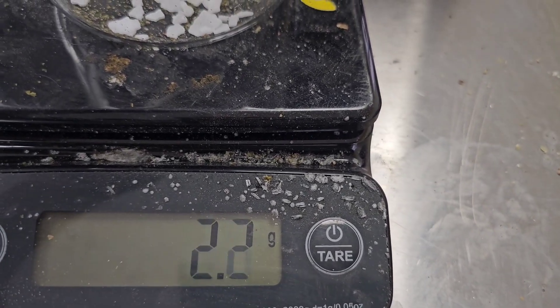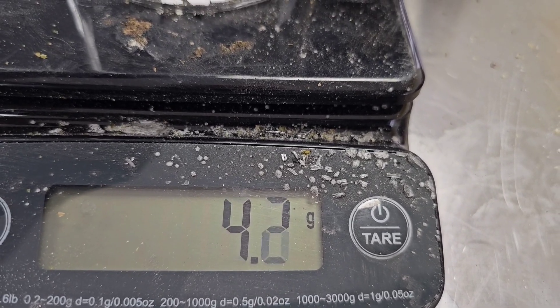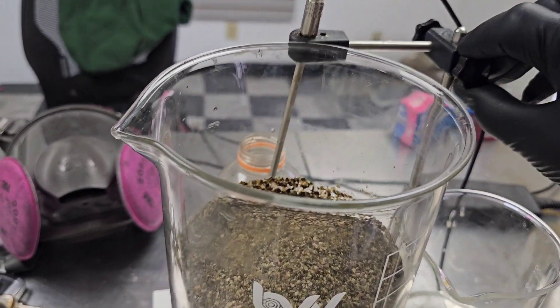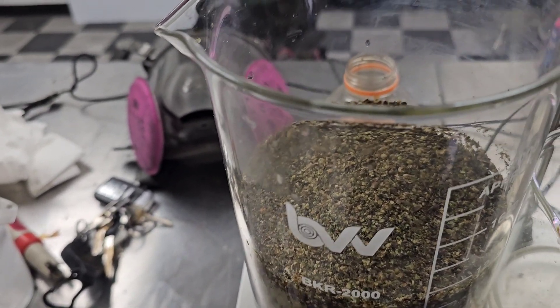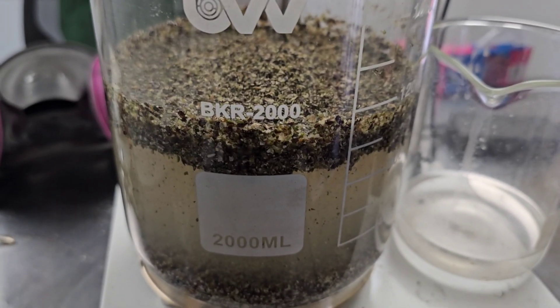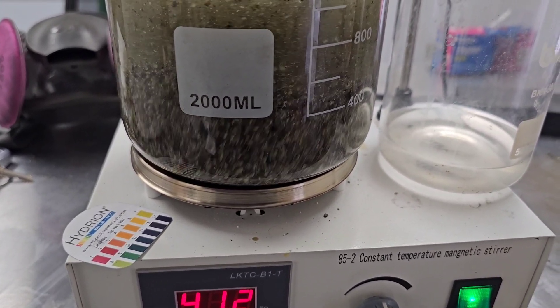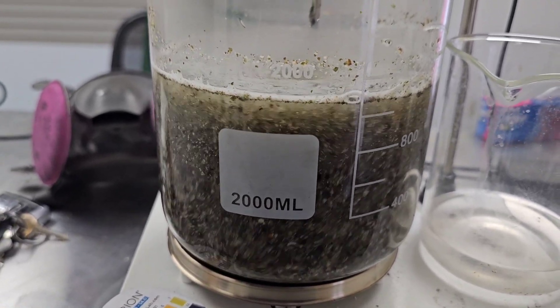Five grams into the container. Before we add it in here, we want to get it agitating, so I'm going to go ahead and put my thermometer on here as well. Let me get this seated — drop it in — and let's get a stir bar. Bloop. Now we're going to let this mix for hours and hours and hours and let it start to chew up that biomass.